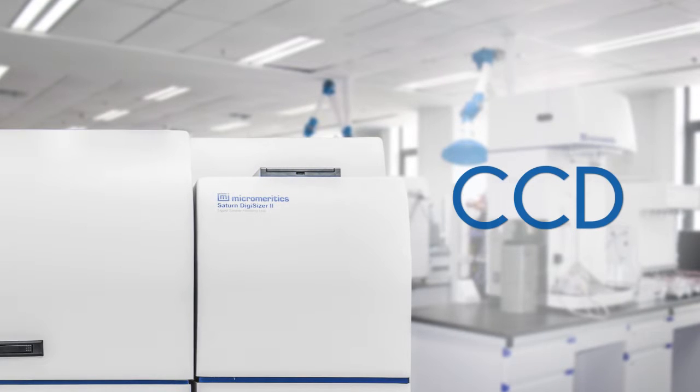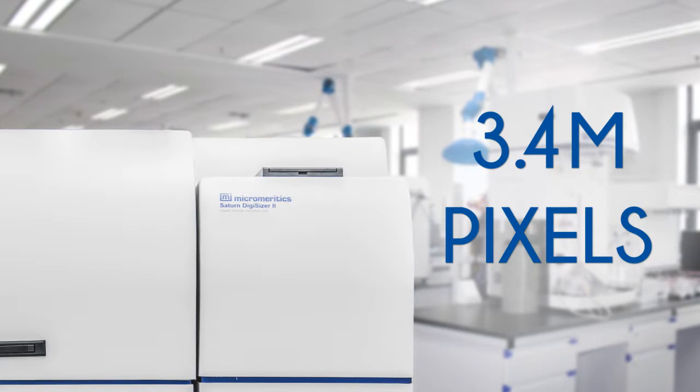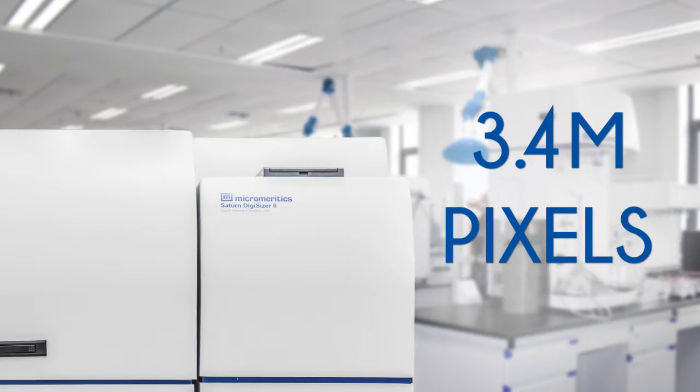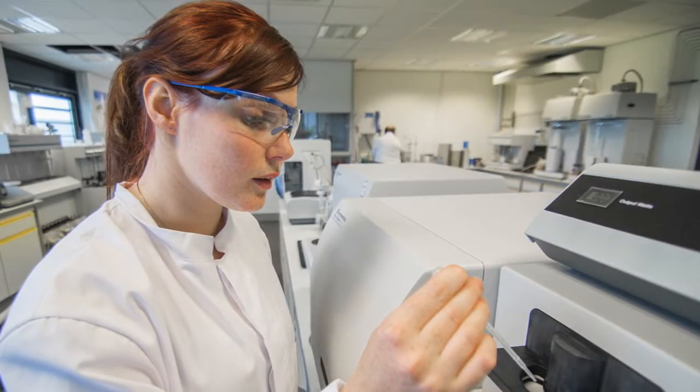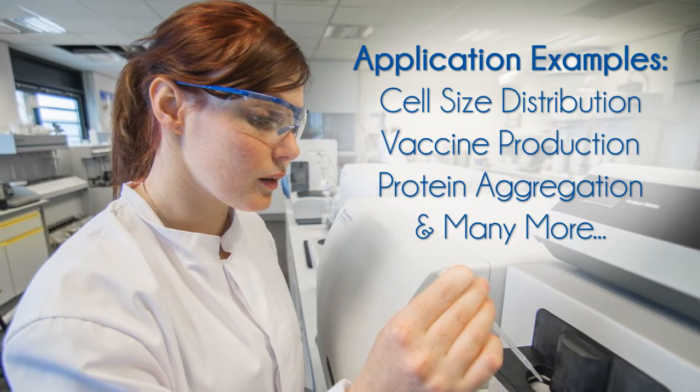The CCD has over 3.4 million pixels or detector elements at each angle for a total of 47.6 million detector elements.